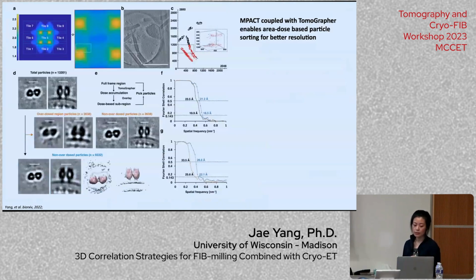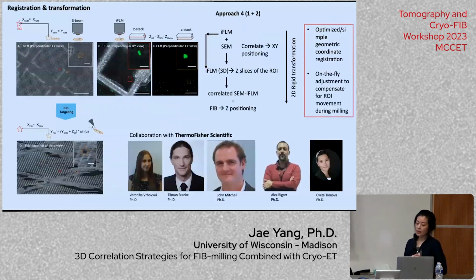We also did more analysis, because right now you have dose simulations and a dose profile, so you can pick the particles based on your dose distribution, and that can lead to a better resolution. Moving from that, we wanted to combine approaches 1 and 2 together in a more efficient way, because not everybody wants to feed the cells with beads.